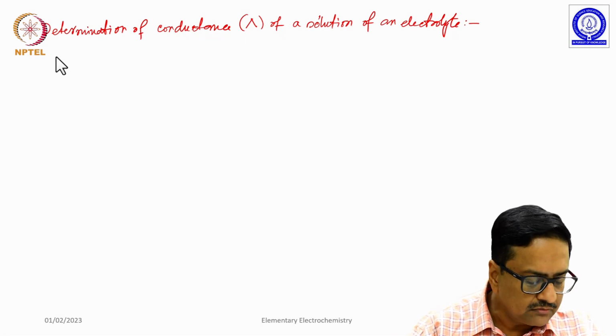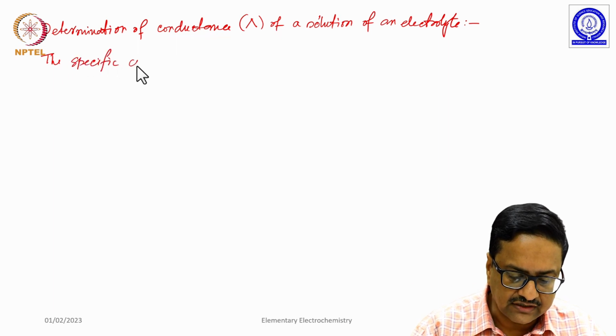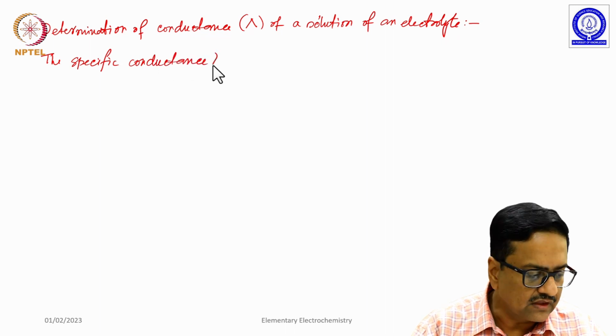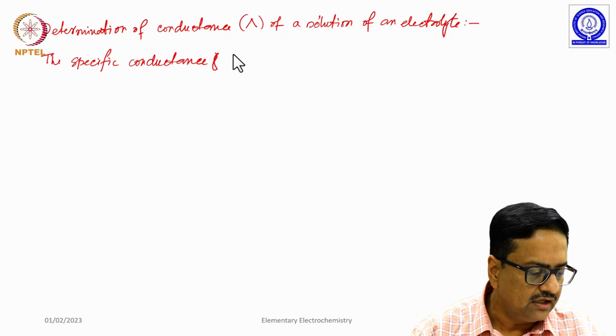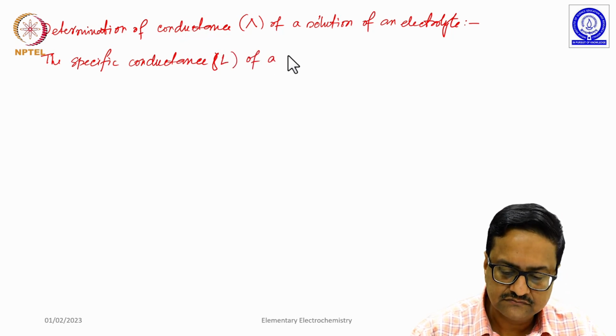So, why do we need to determine the specific conductance, that is capital L, of a solution?